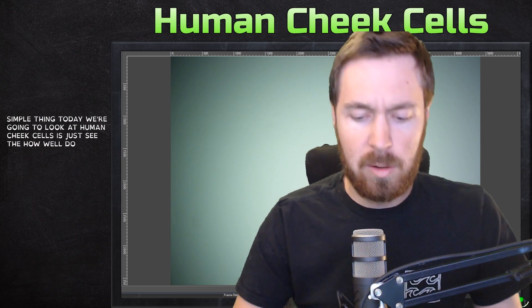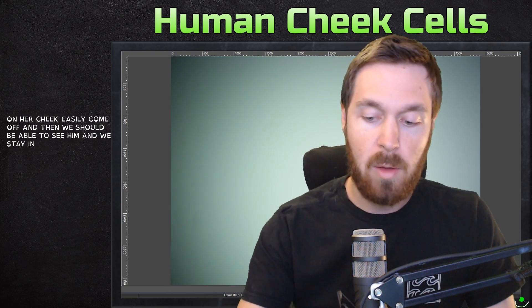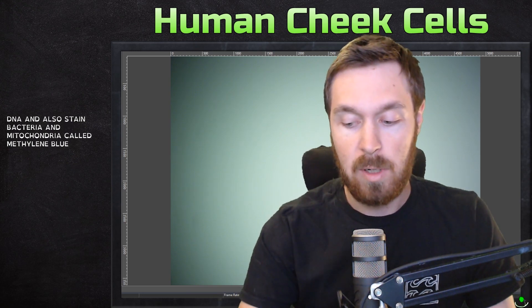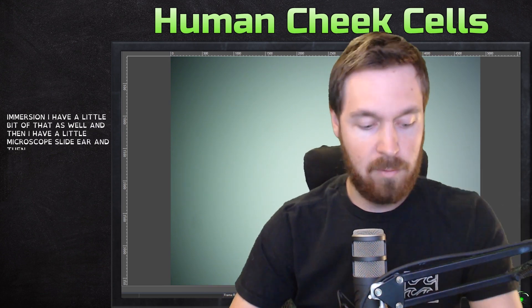Just to start with something simple, today we're going to look at human cheek cells and see how well the microscope works. We need a few things: we need a cheek, a toothpick to rub the inside and collect buccal epithelial cells. We stain them with methylene blue, a dye that stains nucleic acids — so DNA, bacteria, and mitochondria. If we use oil immersion, I have a little of that as well, plus a microscope slide and a cover slip.